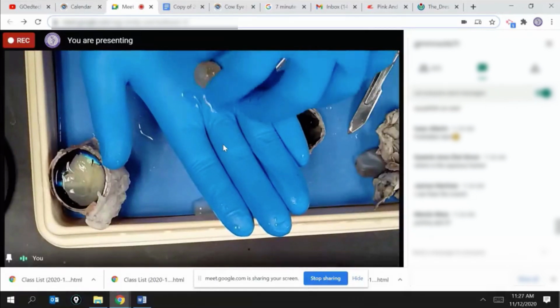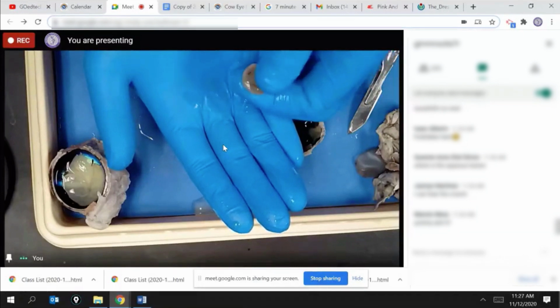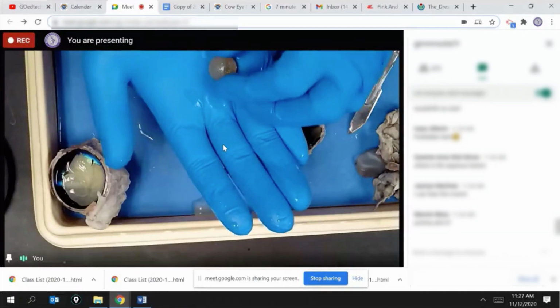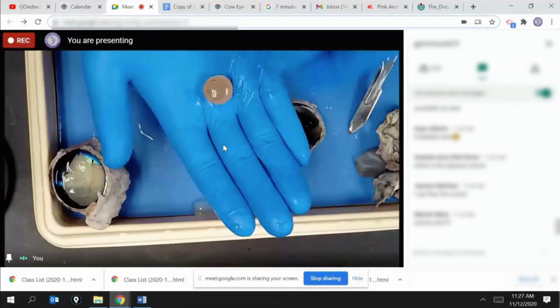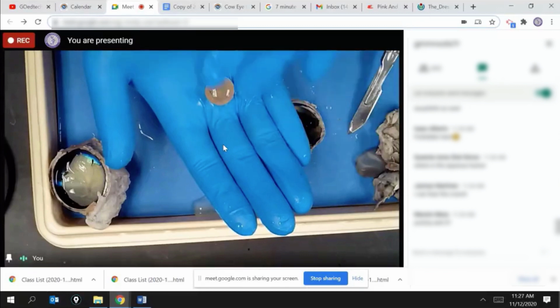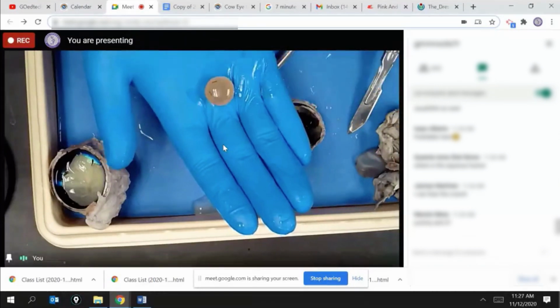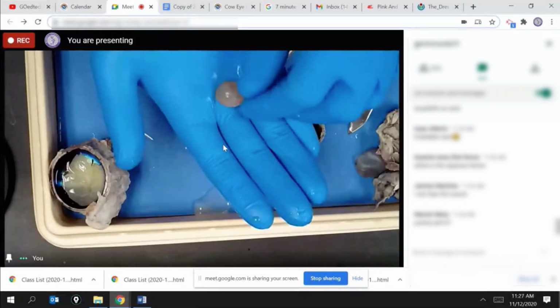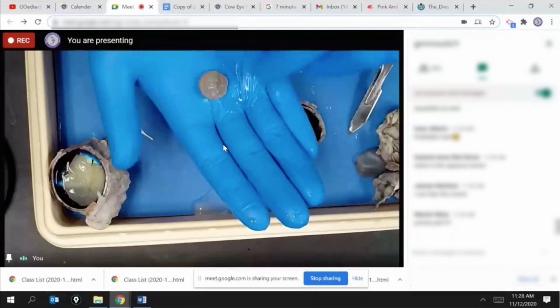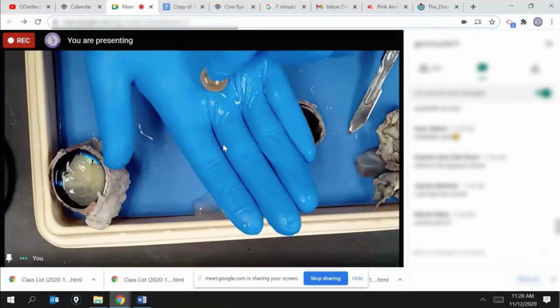The thing about the lens is right here, it's kind of hard on the outside, okay? It's hard like that normally, but not this hard. And it's soft on the inside, which allows it to be moved around quite a bit. Now, this is kind of like an onion. It has layers, and you grow new layers every year. So it does grow. It's not just a stagnant piece. It actually grows over time and replaces old layers. Okay? And so that is the lens.